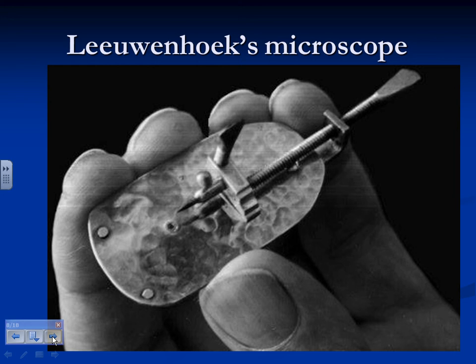Okay. All right, so this is how it would work. You're looking at the back of it, actually. The front is the other side. Think of a hotel peephole, that little lens that you look through at the door. And the other side looks big. Yeah. This is the same idea.